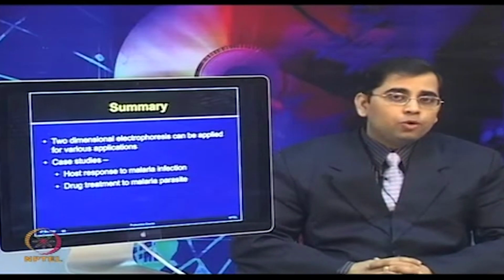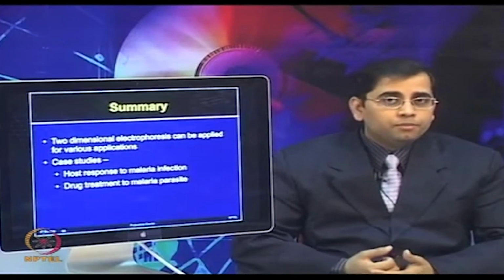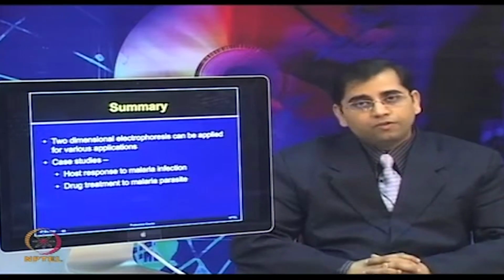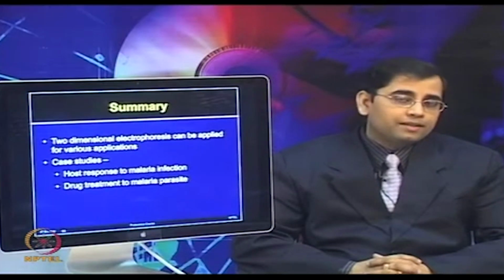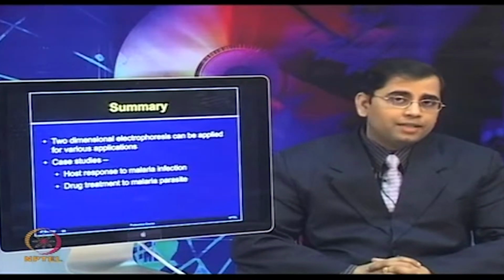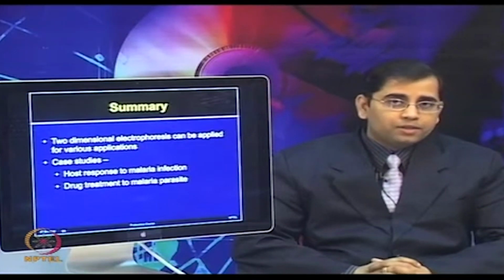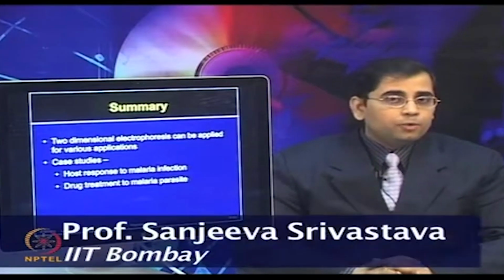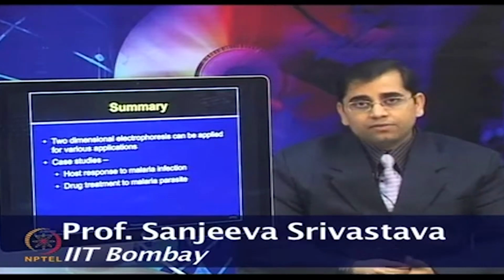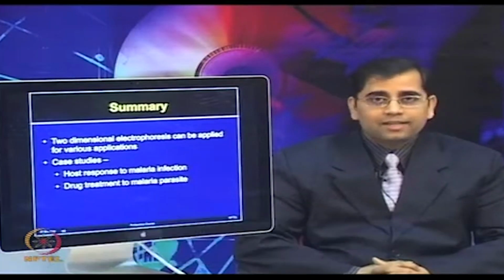So, today we discussed not only one application, how host serum proteins change due to one of the Plasmodium parasites, but also the various nitty-gritty experiments one needs to perform to achieve such a comparison. We will continue our discussion on some more applications of two-dimensional electrophoresis and also two-dimensional difference gel electrophoresis, because due to the variations in 2DE, people also try 2D DIGE experiments, and that is very sensitive. So, that also expands the overall proteome coverage. We will continue our discussion in the next class. Thank you.